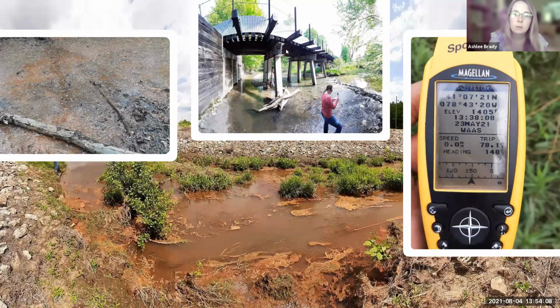And this middle image here, you can see, is me taking readings from a water sample from a stream up around by the mall. This middle image that runs through all of these here, as you can see, it's very orange. It's very gross still. It's highly affected with iron. And this last image is just the GPS that I use to get my latitude and longitude coordinates. And that can be used for if somebody else were to come out and take measurements like I have.